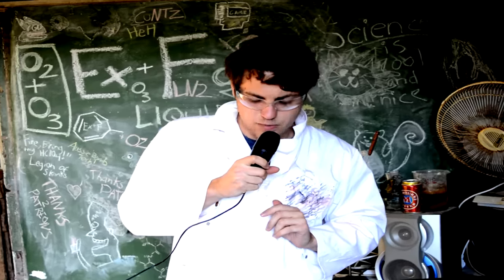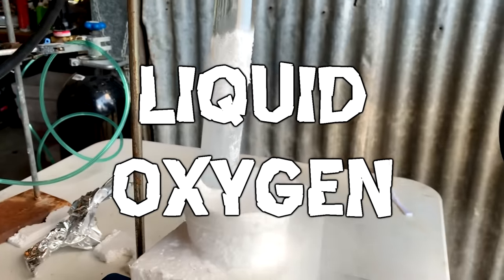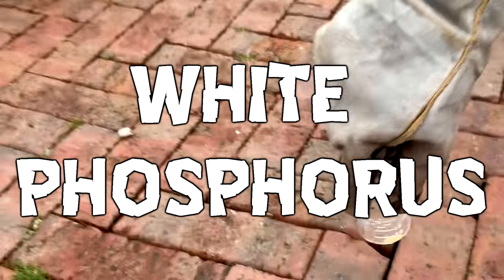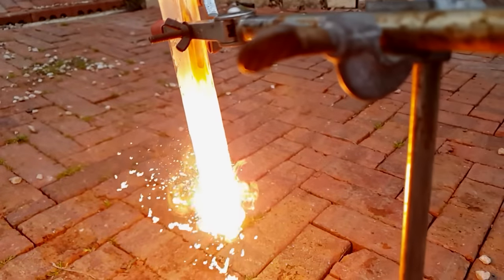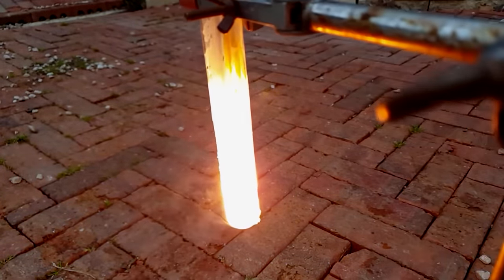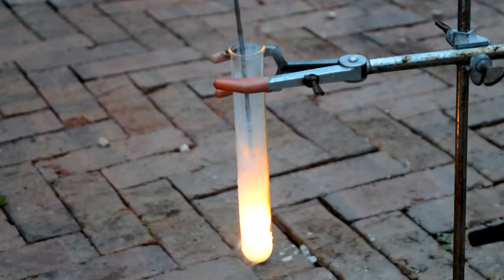Alright, one more experiment. What if we take just some normal liquid oxygen — no ozone, just run-of-the-mill liquid oxygen — and we put something in it that really likes oxygen, like white phosphorus, and we dunk that into some liquid oxygen? How that test tube survived a 400–500 degree temperature change within half a second, I don't know.